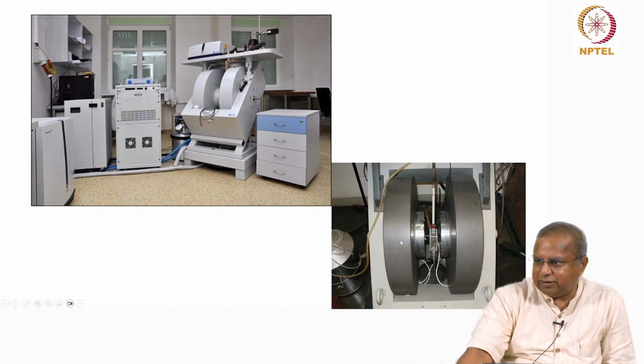And that is the magnet. Okay, you have large electromagnets here. This is the EPR tube, a special quartz tube, in which the sample sits, and it sits in between these two magnets. That's the way the measurements are made.